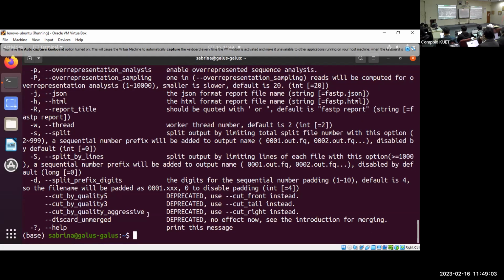Okay, so our first two things were analyzing the quality and then trimming the data according to the quality. I mean, whether we need filtering, or whether we need to cut the front and later part, or maybe we need to filter for the adapter sequence or primer sequence, etc.